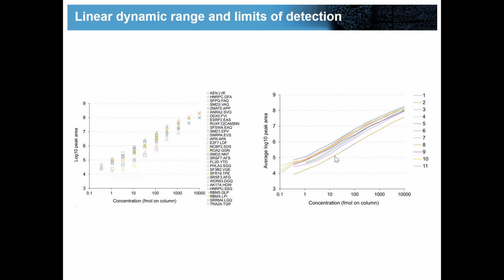Yeah. So I have a question about if I add some modification, like phosphorylation, in the data set, it will give a lot of false positives because the mixture spectrum makes it very complicated. Yes. Well, so, I mean, there's a couple of layers to that. Certainly the way that you score PTM peptides is going to need more attention than you do for unmodified peptides. So particularly isobaric modifications like phospho, where it could be here or there, and you need to look at diagnostic fragment ions to localize that.